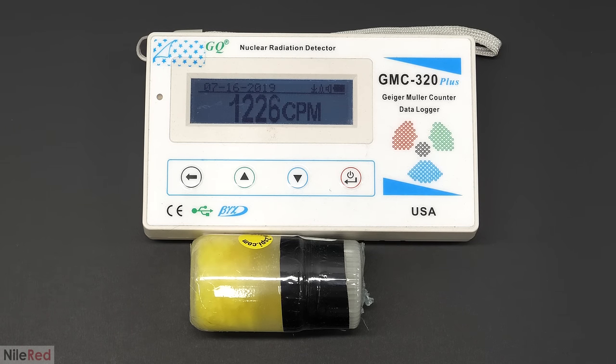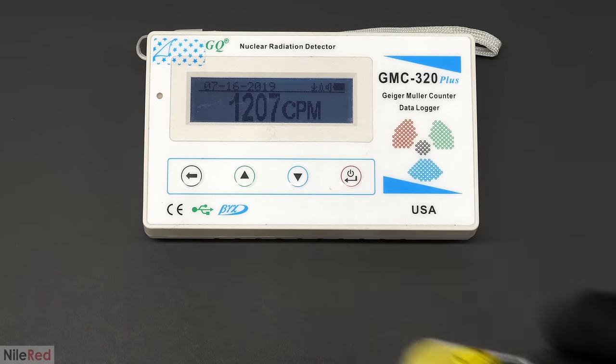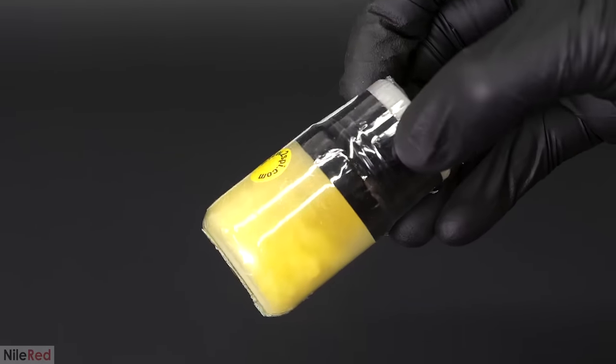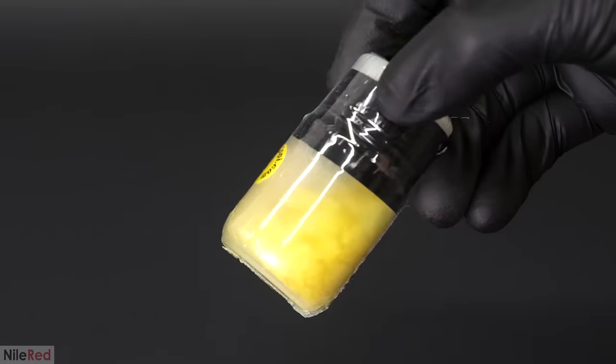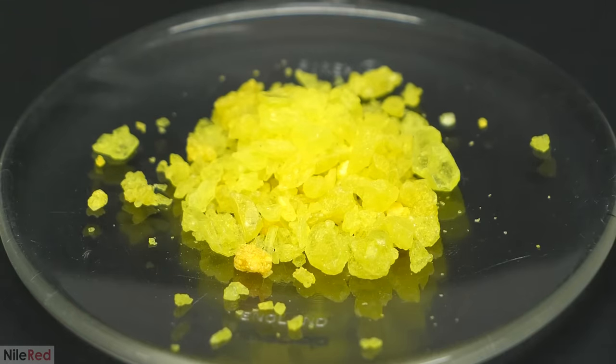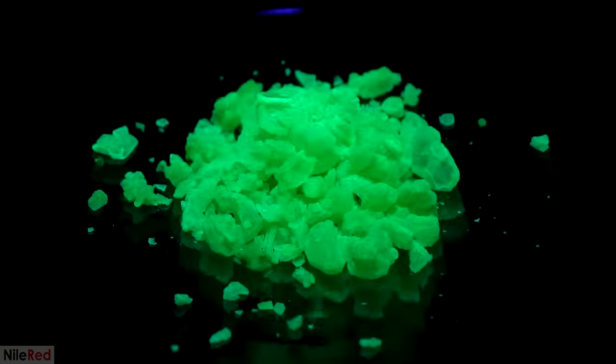Despite this, it's still going to be really useful because I don't actually need a super accurate reading — I just have to know whether or not it's there. Before getting started, I wanted to try one other thing. Uranyl nitrate was supposed to be fluorescent under UV, so I put some on a dish, turned off the lights, and shot it with my blacklight. And well, it was definitely fluorescent.